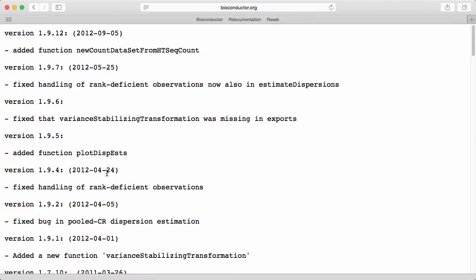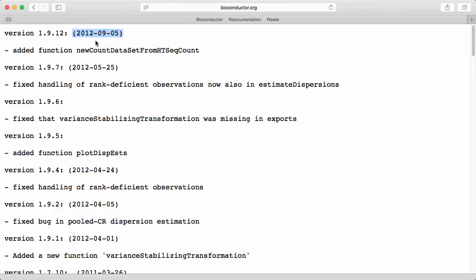This is a text file and we can see here that the author has added some information about what has happened in the various versions. This is probably out of date. You can see the last comment was added in 2012 and late 2012, the second half of 2012. I'm pretty sure that this package has changed since then.